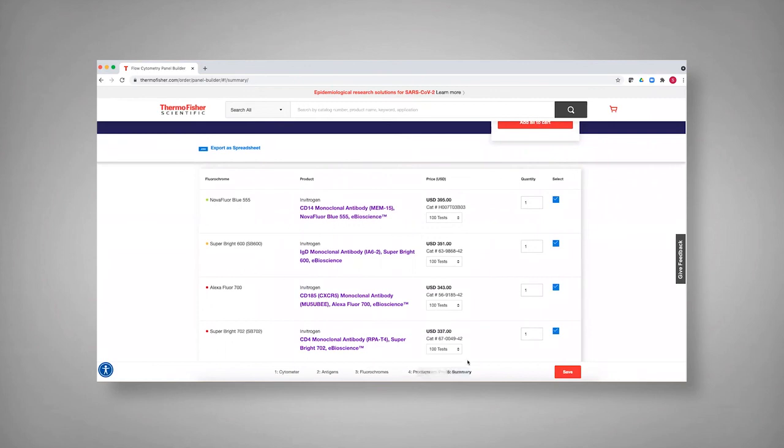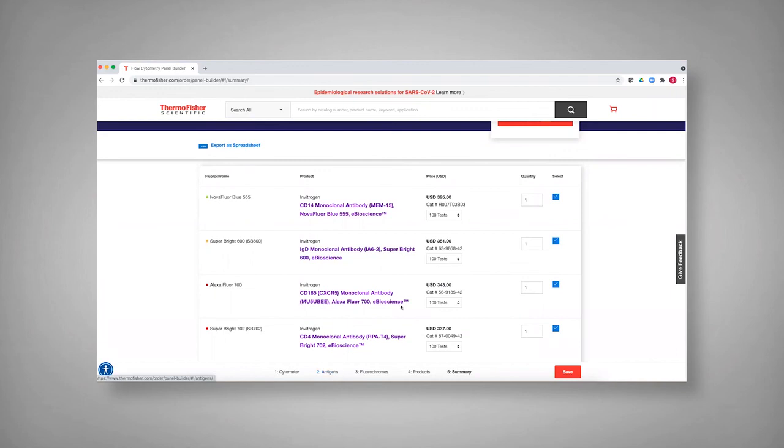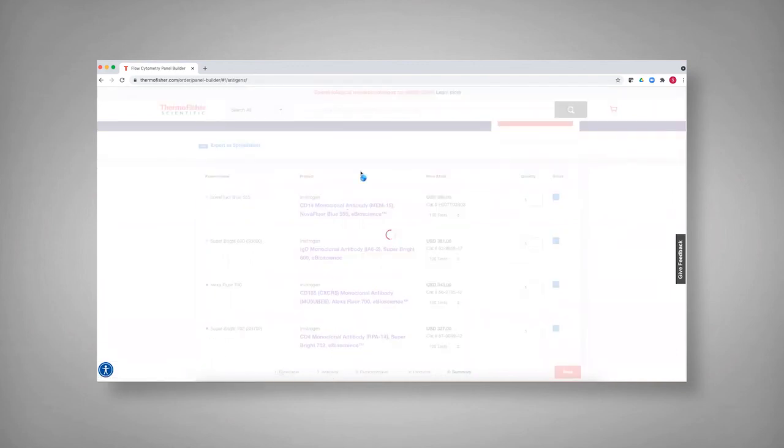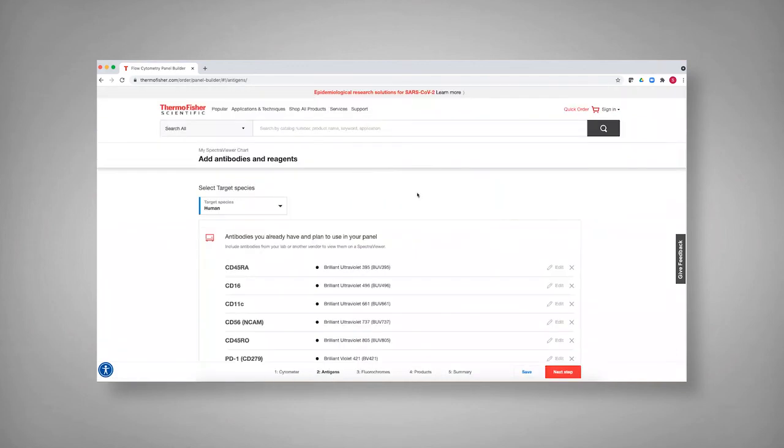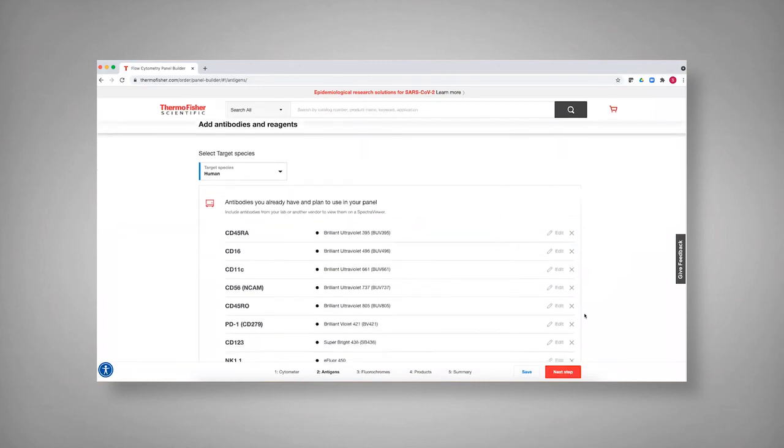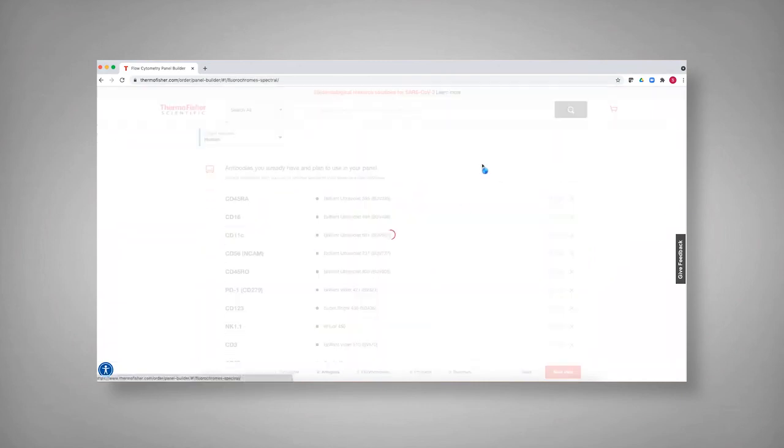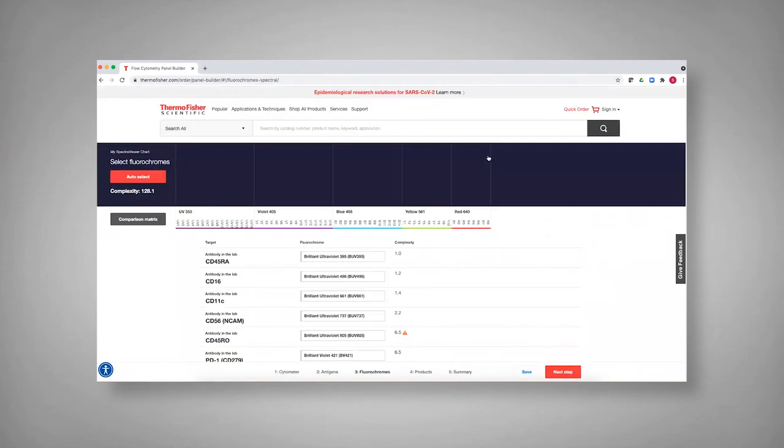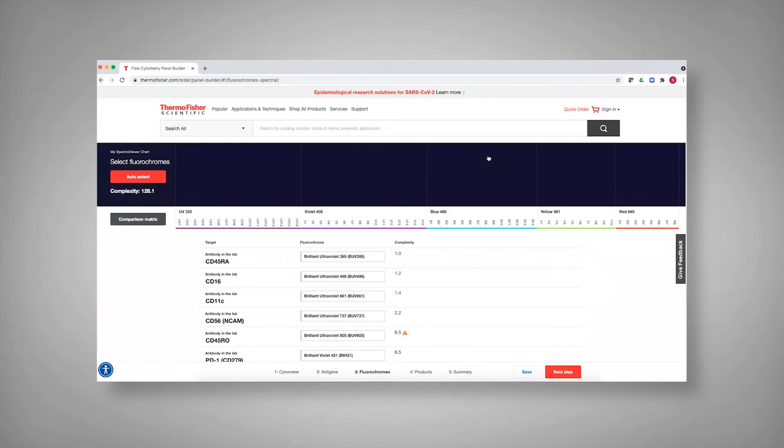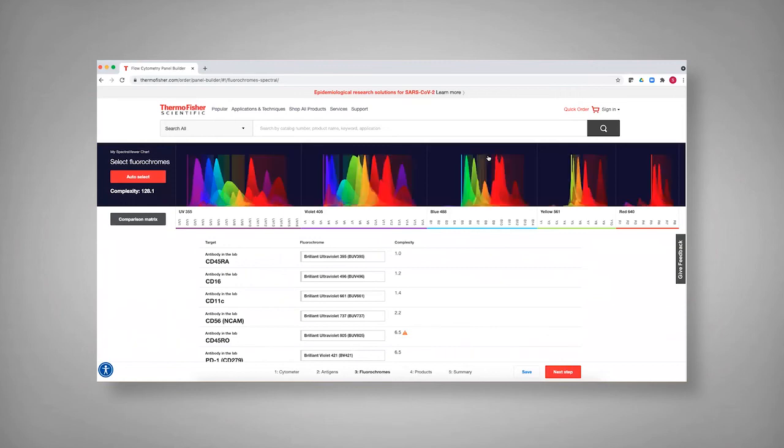And I can even go back through, if I've assessed this, I can even go backwards to this step and say, wait a second, let me take one of these antibodies out of my panel, and then look back at how that might affect what I'm seeing. So it's a way to combine both panel design as well as the iterative data. So I think it provides a lot of opportunities.